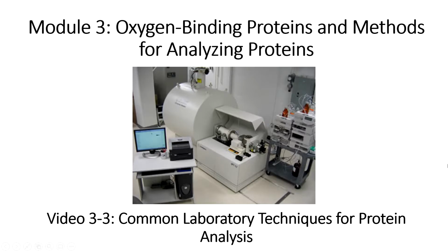This is Module 3, Oxygen Binding Proteins and Methods for Analyzing Proteins. In this video, Common Laboratory Techniques for Protein Analysis, I'll be describing several different methods for how we quantify proteins in the lab and also characterize proteins in the lab. So for the rest of this module, I'll be discussing protein analysis methods.